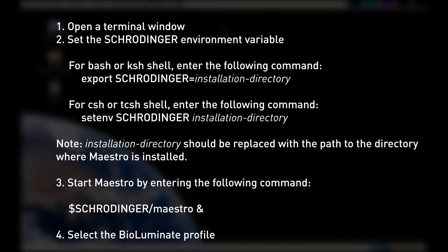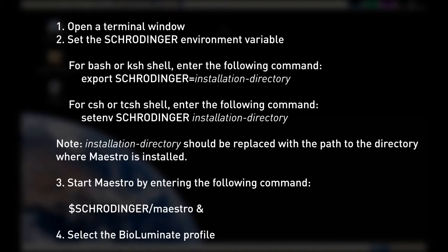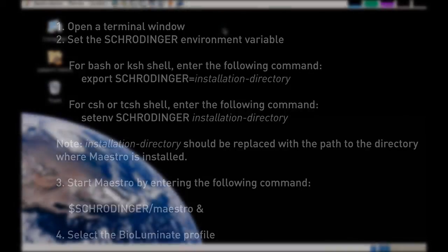To start BioLuminate under Linux, first open a terminal, then set the Schrodinger environment variable, pointing the path to your specific Schrodinger installation directory. Then launch Maestro by typing $Schrodinger/Maestro, and then select the BioLuminate profile.